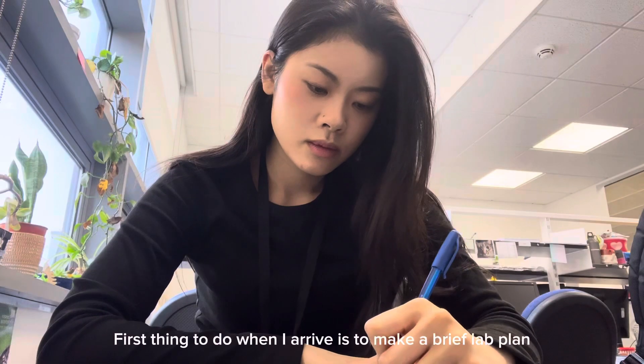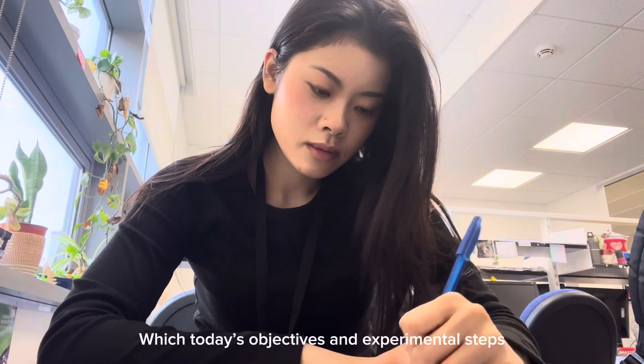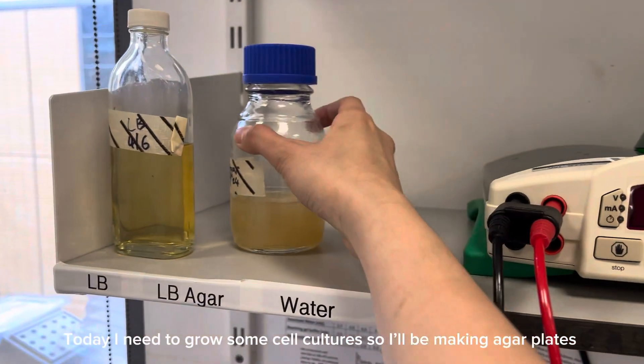The first thing I do when I arrive is to make a brief lab plan which includes today's objectives and experimental steps. Today I need to grow some cell cultures, so I'll be making some agar plates.